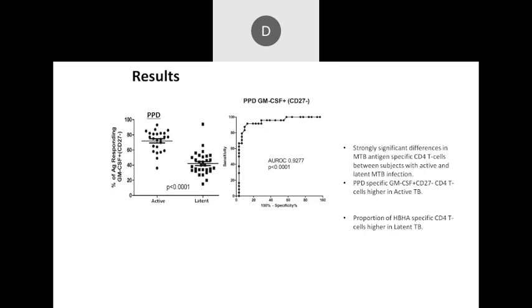I think my understanding, the problem with the GeneXpert is it doesn't always give you a positive response when there's actual infection, and particularly in TB uveitis, I know that they don't get a very good response there. So I think we should look at all different assays, what can work, and definitely PCR-based assays are very sensitive, you would hope. So at the moment, they would probably be more sensitive and specific than ours.